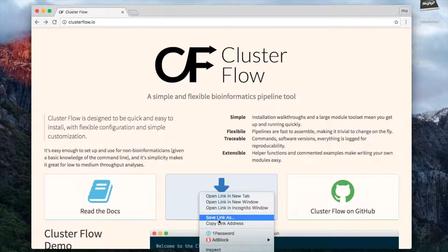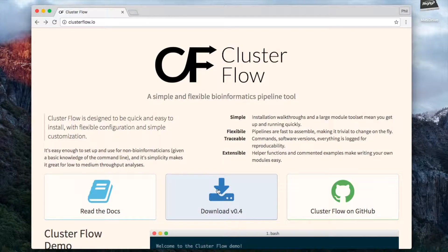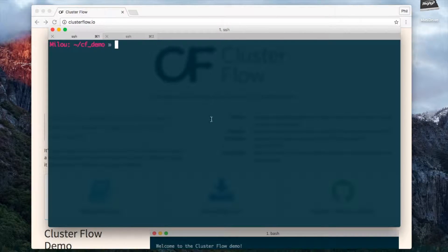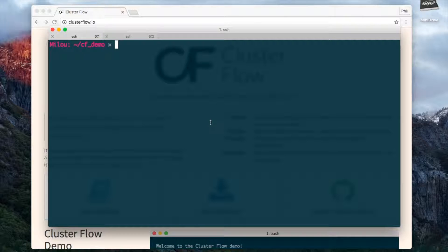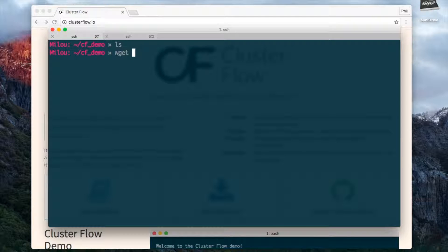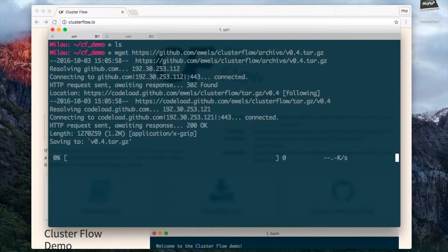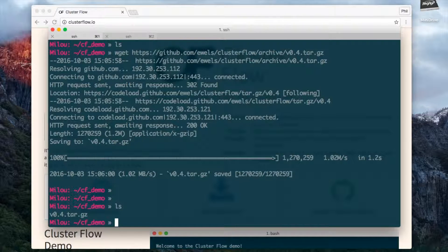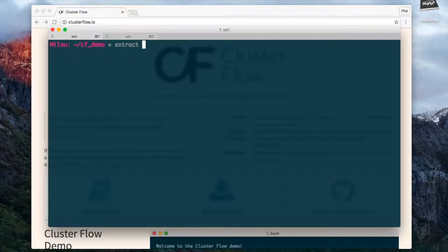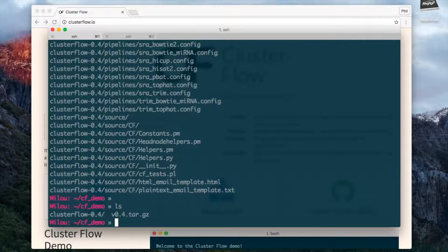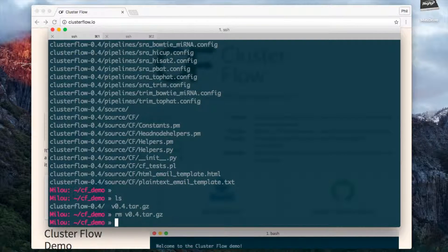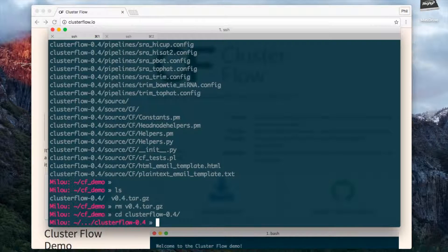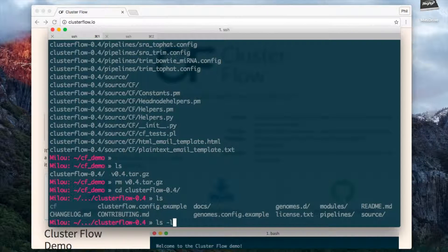I'm going to get the download link here by copying the link address and I'm going to load up my terminal window where I'm running on a Linux slurm cluster. I've created an empty directory for the demo which has nothing here yet, so I'm going to download the files. Now I'm going to extract those files and now I have my directory. I'll remove the tar file and cd into clusterflow and I can see my files here.